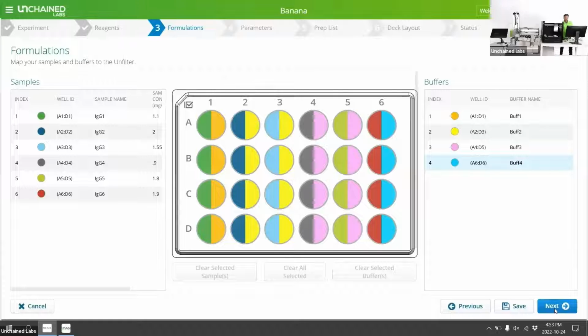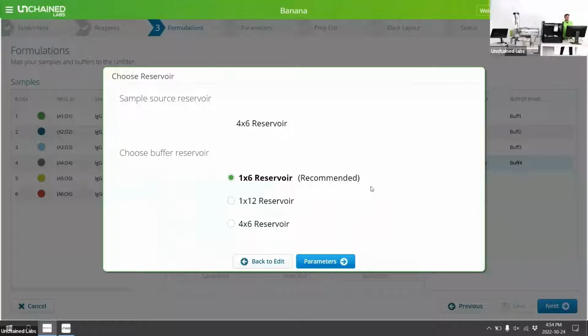And a nice feature here, if you had been watching, in the bottom right, the next button highlighted. It doesn't do that until everything on each screen, you can kind of see the pit stops on top. Until that section is validated, the operator, you, are unable to go to the next step.